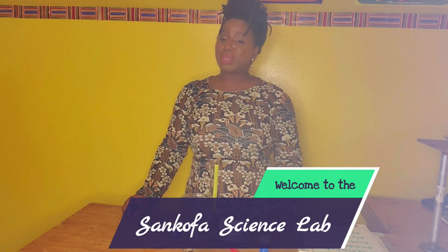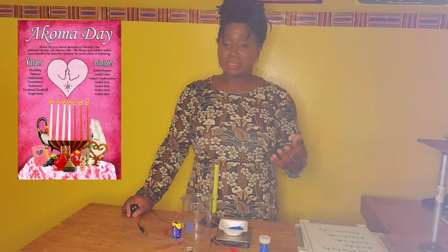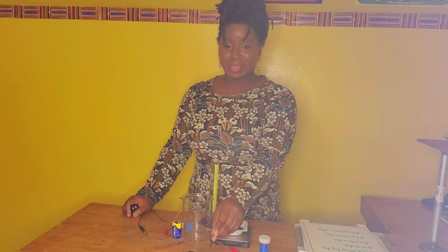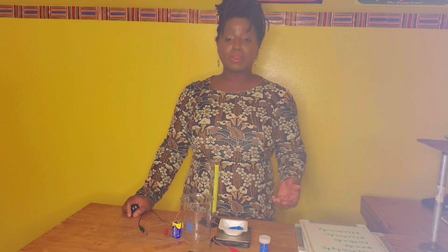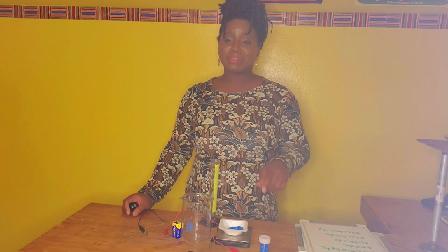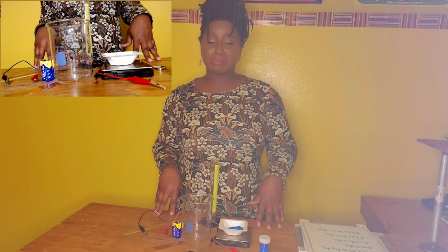Today I have something planned special for you in the lab. In celebration of Valentine's Day and Akoma Day, which is a celebration of Black love for the self, for the family, for the community, we are going to be electroplating copper onto a heart-shaped pendant. Yes, onto a heart-shaped pendant. Absolutely. I'm super excited. In the last lab, we learned about the process of electrolysis, where we were able to use electricity to split water into hydrogen and oxygen gas. In this lab, we're going to be applying that learning to electroplate copper onto that heart-shaped pendant.